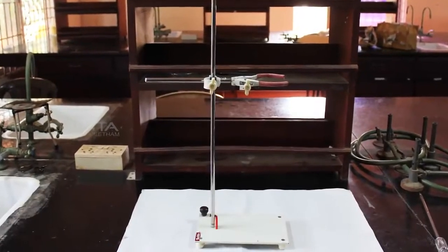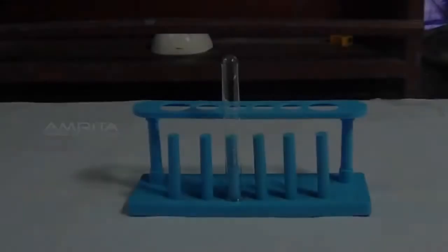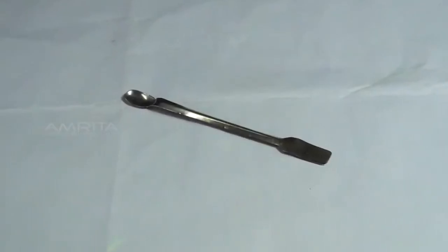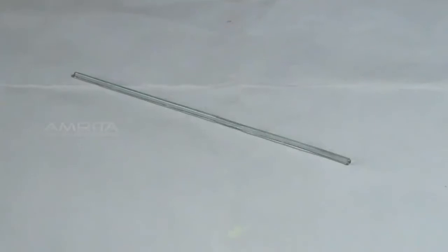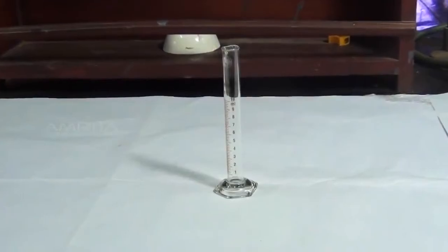burette stand, 20 ml pipette, test tube, spatula, glass rod, dropper, measuring jar.